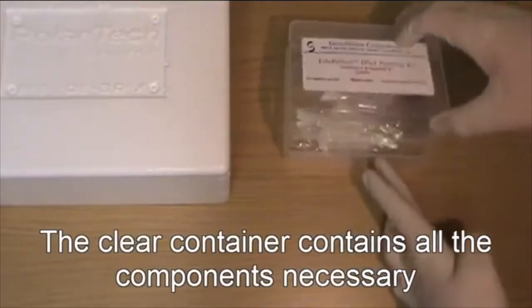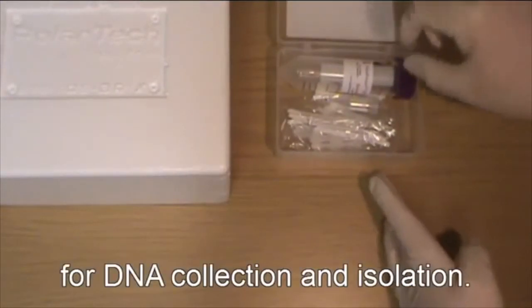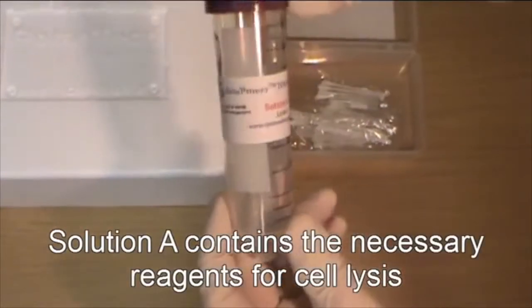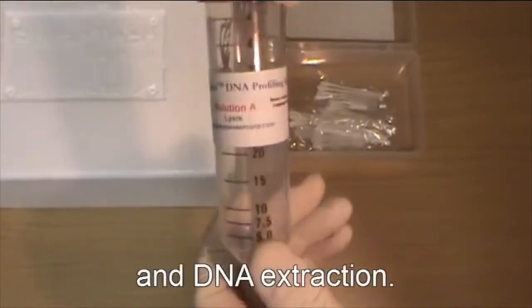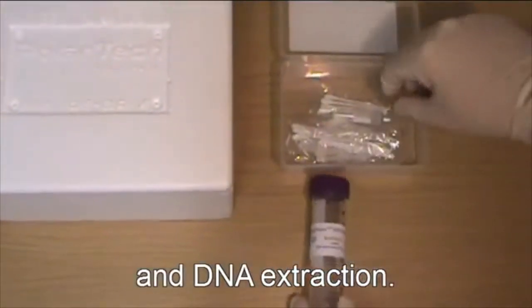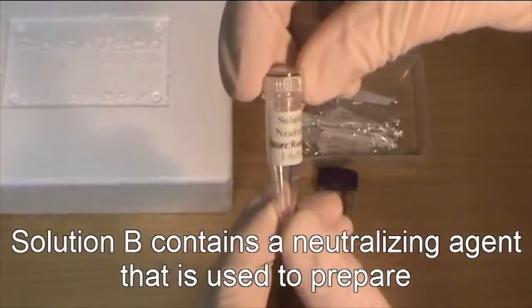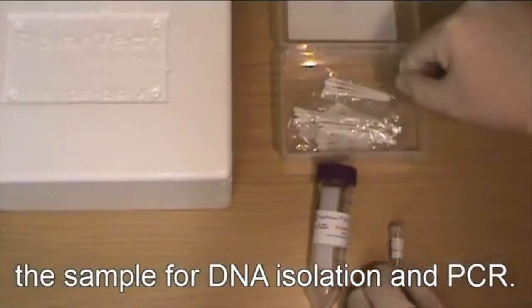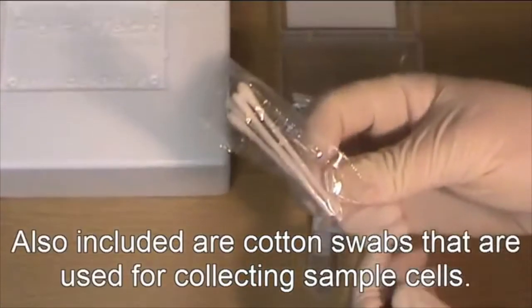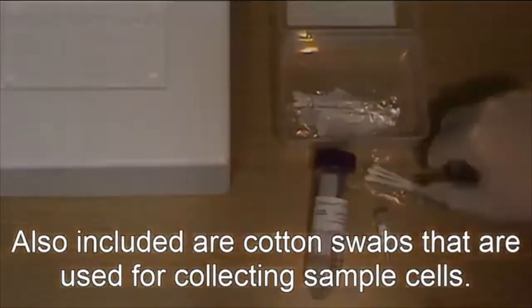The clear container contains all the components necessary for DNA collection and isolation. Solution A contains the necessary reagents for cell lysis and DNA extraction. Solution B contains a neutralizing agent that is used to prepare the sample for DNA isolation and PCR. Also included are cotton swabs that are used for collecting sample cells.